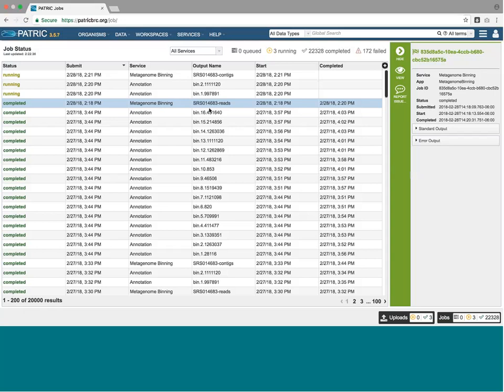After the binning is done, you'll see a number of annotation jobs running. And then when those complete, you'll be able to see your job results back at the binning job. And so with that, I'm going to hand this over to Bruce, who's going to tell you much more about the binning results.